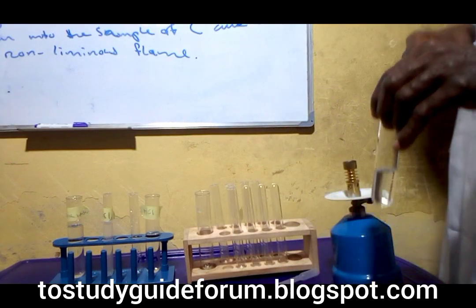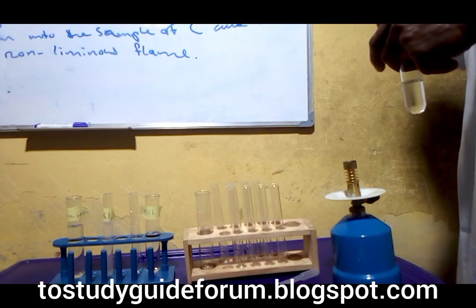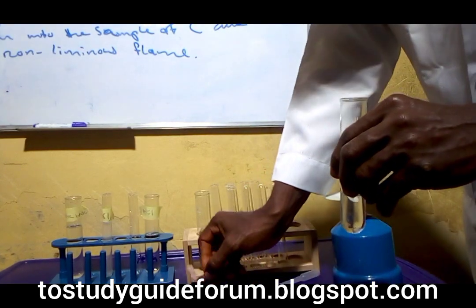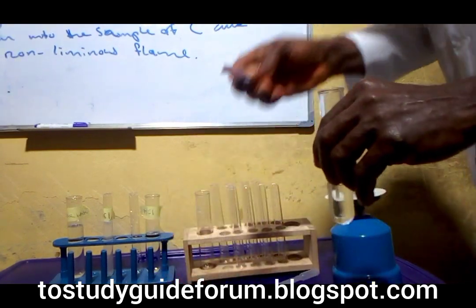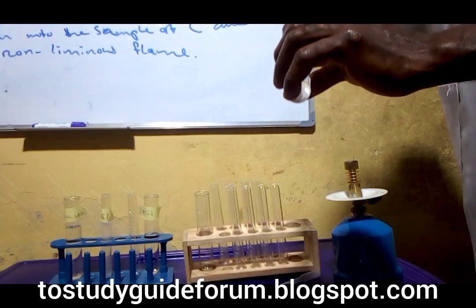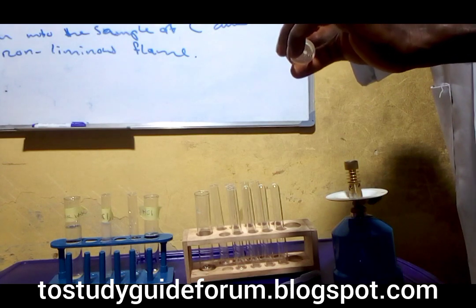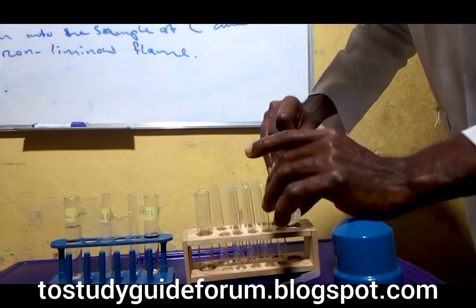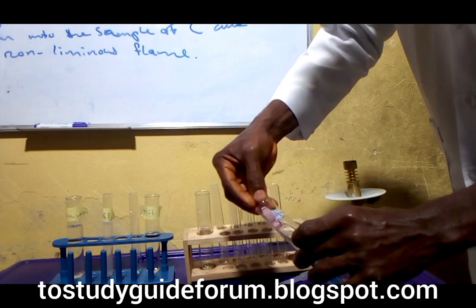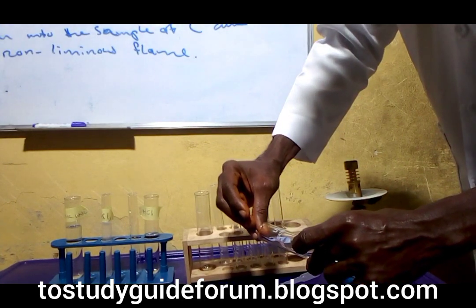So the next one said that to the mixture above, add litmus paper. Then we take our litmus paper and put it inside to see what we are going to get. Now this is our litmus. All right, it's getting there.